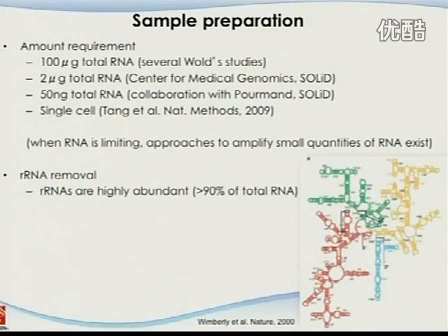And we had one study in collaboration with an investigator in, I think, Columbus, Ohio, and a hospital there, and they study bacteria, okay? And they're trying to do RNA sequencing using the Illumina platform. And we are very happy about that, and say, good, let's do it.